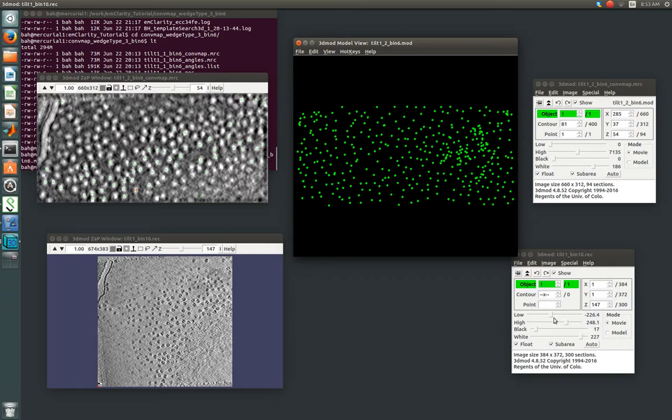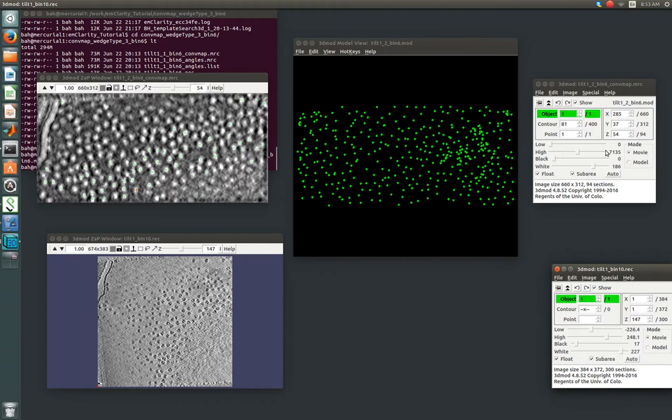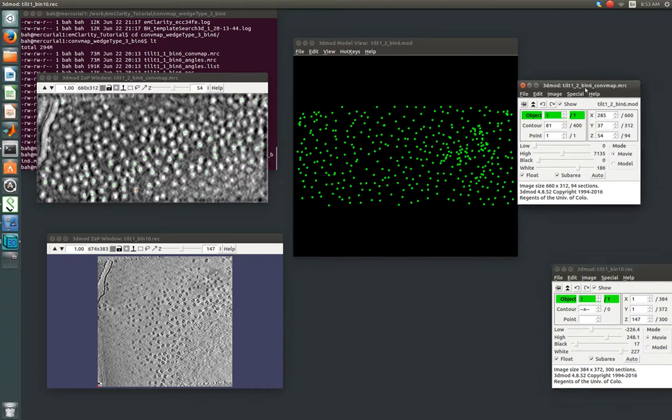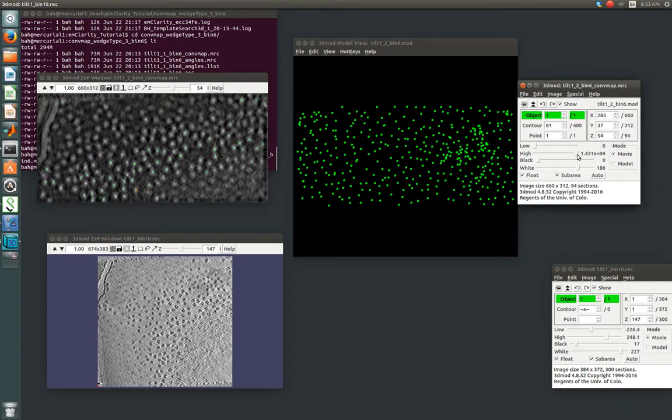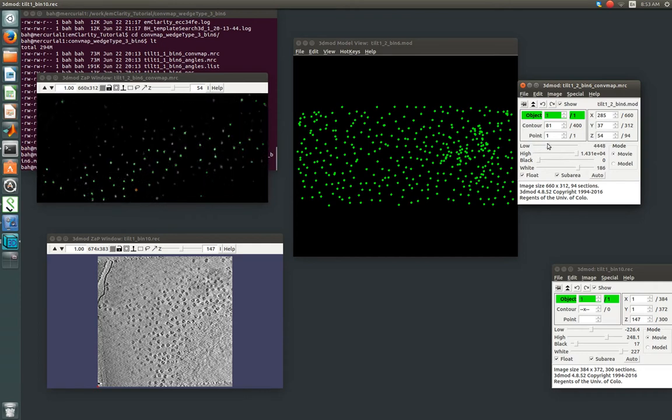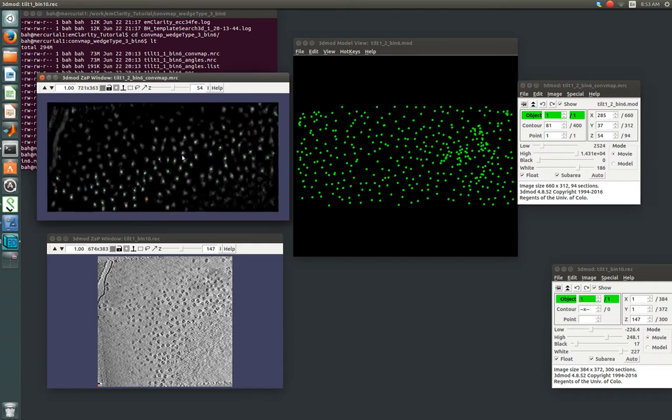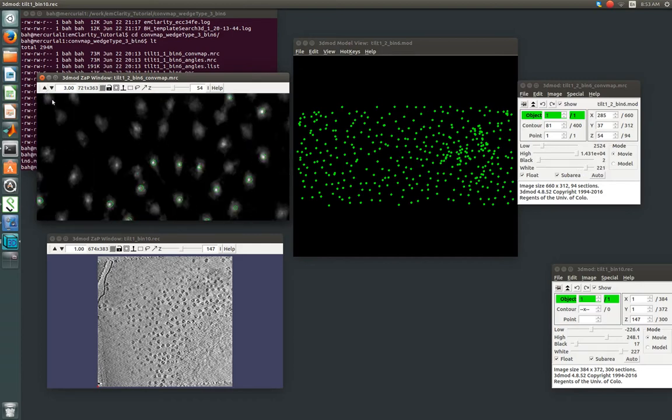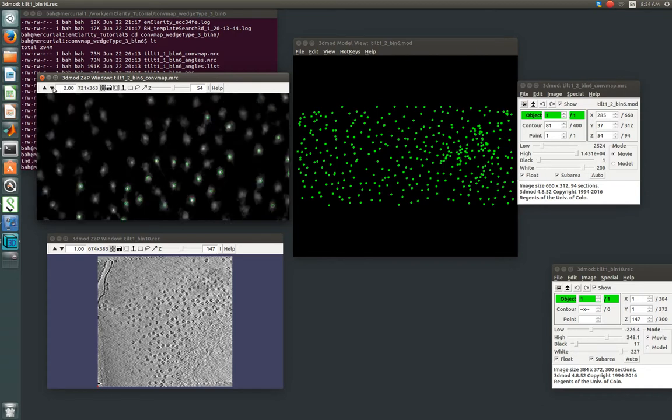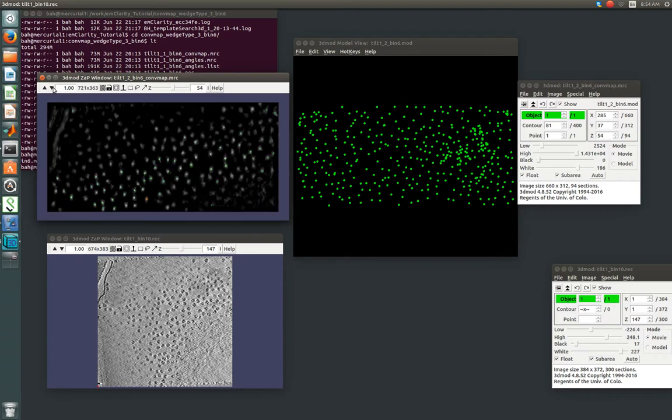Now, if we take over here in the imod menu, the slider bars, we can raise the threshold for white and black a bit. And one thing that does show you is the actual absolute value here of the cross-correlation hits is really high for a particular position. So for the ribosomes, it's a little more diffuse. There's a lot of similar-looking features, and that's because it's so globular.